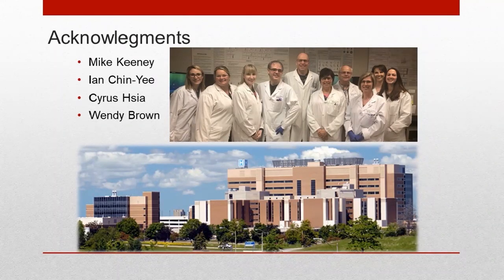We don't always do them at relapse because we already know what we're dealing with. But yes, we do them in some of the cases that I presented. We would have to do an intracellular tube, which is not available currently with the ClearLab 10 color. So yes, there is still a requirement to do an intracellular tube. We do it every time we get a new one.